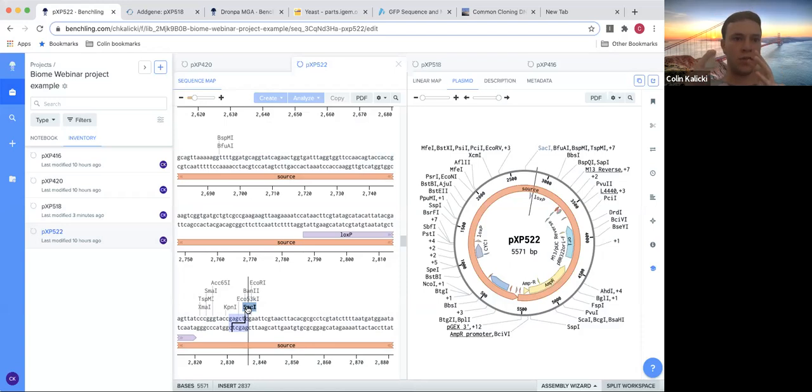This is one way, a method in which they're going to maybe put these plasmids together. We'll probably talk about this after I'm done actually designing the enzyme. Now, Gibson Assembly is going to erase this cut site. So one way you can model this is just erase this cut site now or copy over it. So I could go here and just put Command V.